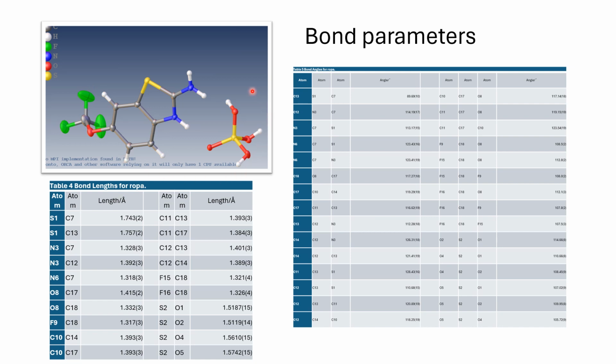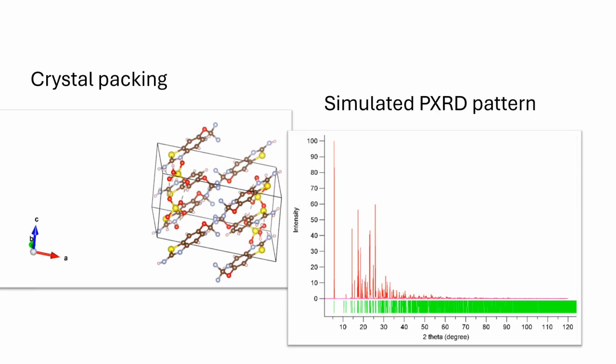this is the actual structure of the molecule. The benzene ring and the sulfur atom, nitrogen atom, that ring contains heteroatoms, and also there is an NH2 substitution over here. We can see over here that benzene has a substitution of OCF3, and we can see that this elliptical sphere is so unsymmetrical due to fluorine electron density, right? And these are the bond parameters, the bond angles given over here.